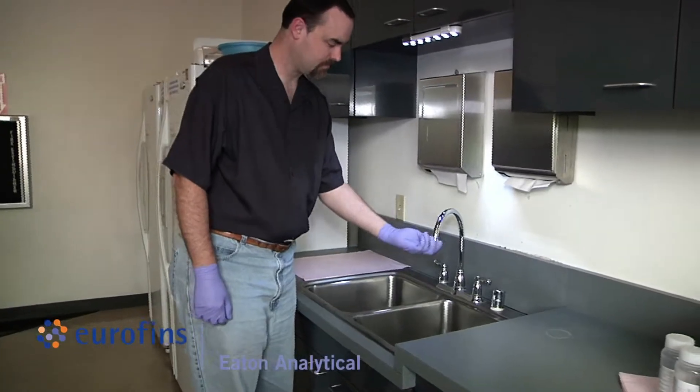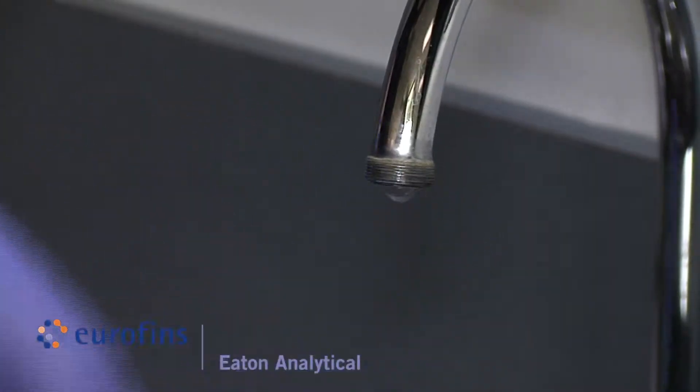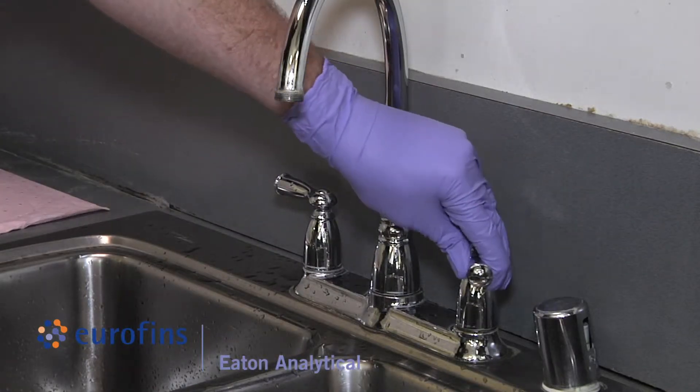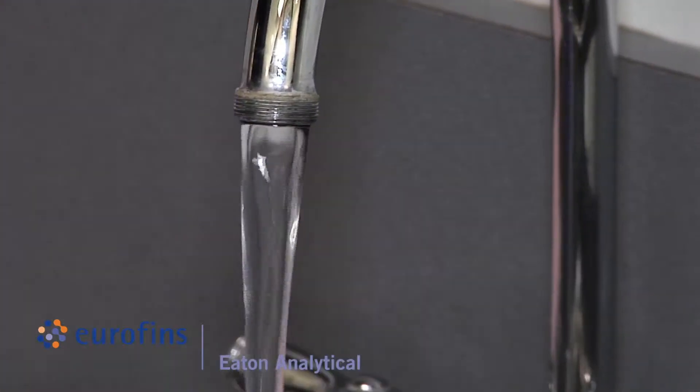Before sampling, remove the aerator and screen if sampling from a faucet or tap. Open the tap and let the water run at fast flow for approximately five minutes.